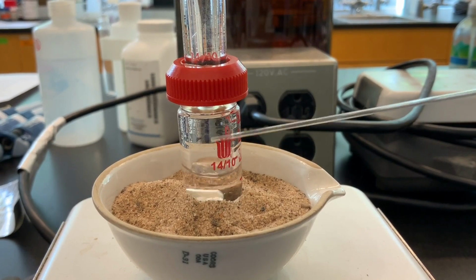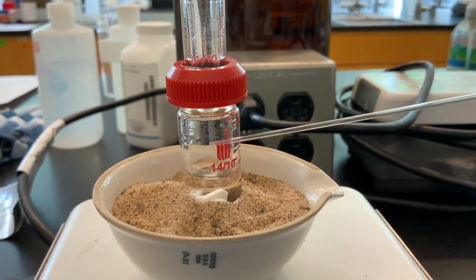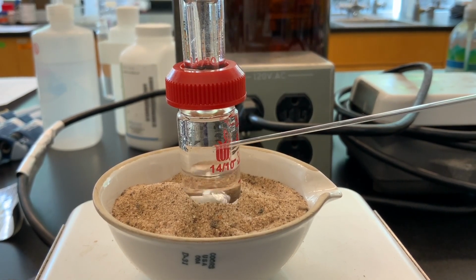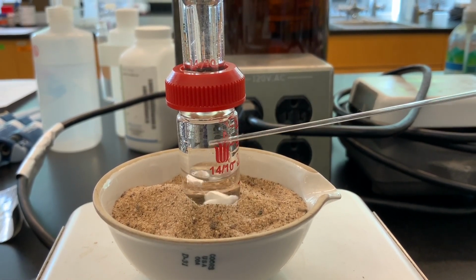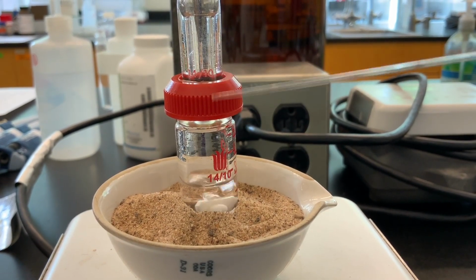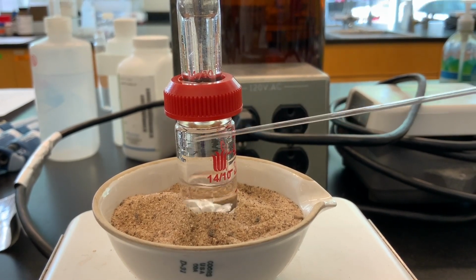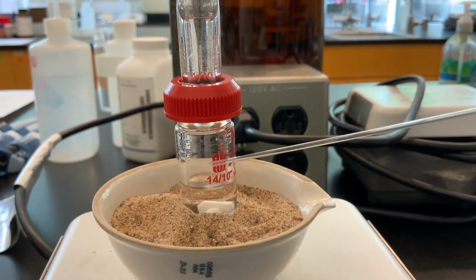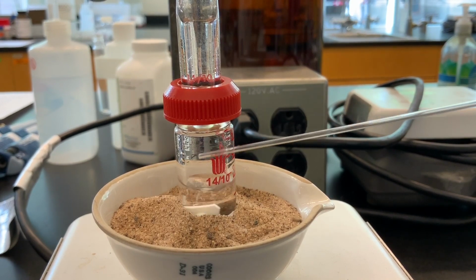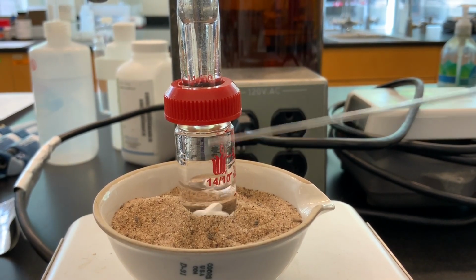Once it's established in equilibrium, that is to say that the glass is the same temperature as the boiling point of the vapors themselves, then it'll no longer condense here. In other words, it will continue to climb upwards. So right now we're just waiting for this part of the glassware to be around the same temperature as the vapors, so that it won't keep refluxing in this area.